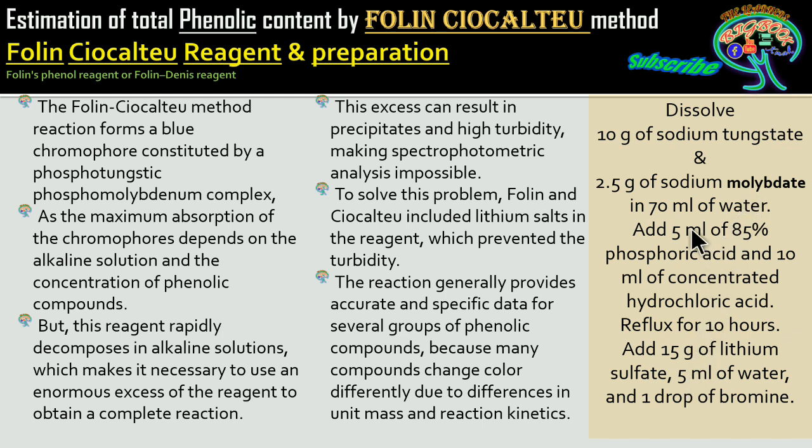Further is this one, where they make the Folin-Ciocalteu reagent in this manner. This is the one I have discussed, how it is going to react and how it is going to give the color to the polyphenols or the phenols or the antioxidants present in the samples or the standard series. In the same manner this is also going to work.